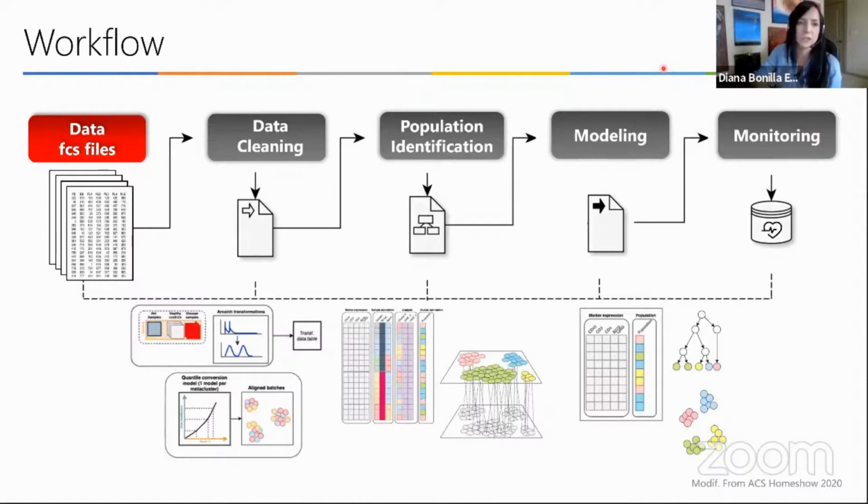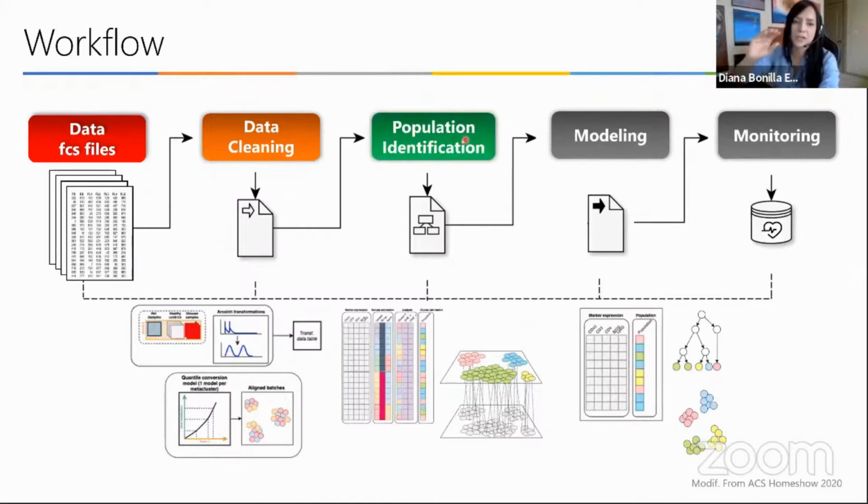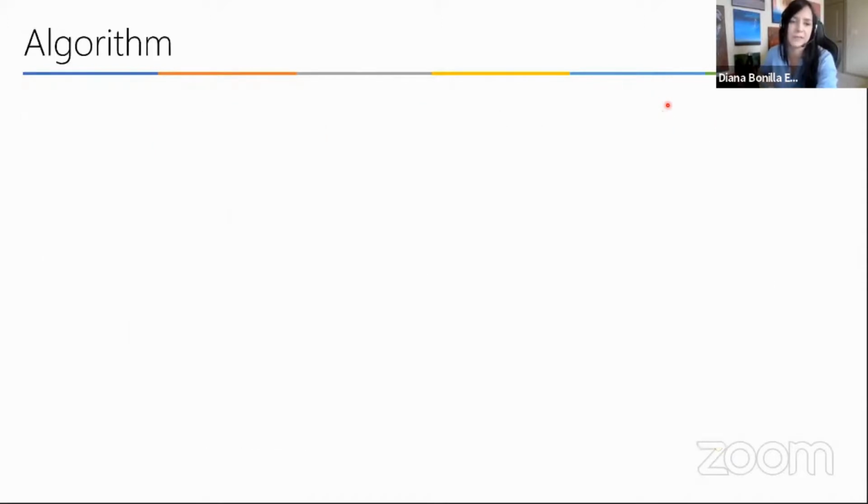Everything starts, independently of the technology, with an FCS file that contains every event in your sample characterized across multiple detectors, fluorochromes and markers. You first need to start with data cleaning, as I mentioned before. You then identify a method to characterize the populations, the different subsets in the sample, and ideally to be able to correlate that with the metadata of your clinical study, of your experiment, any characteristics about the study: responders, non-responders, treated, stimulated, different subjects, different time points. And ideally, after that, we all hope that we can identify biomarkers or help guide clinical or treatment decisions with any of the findings.